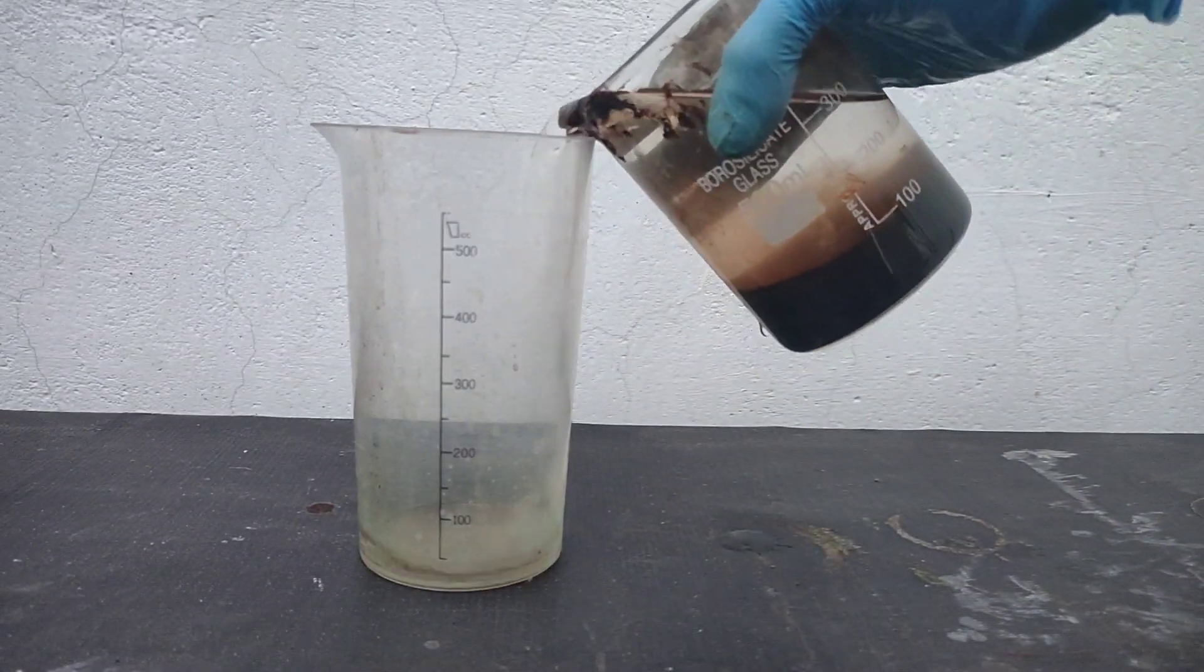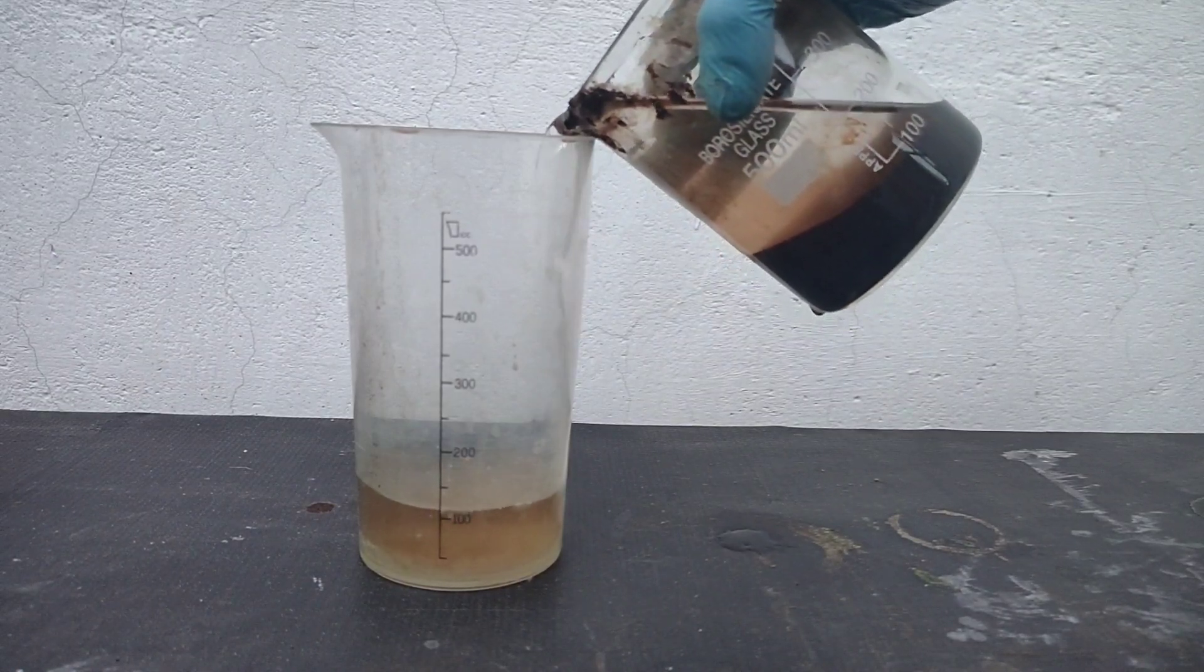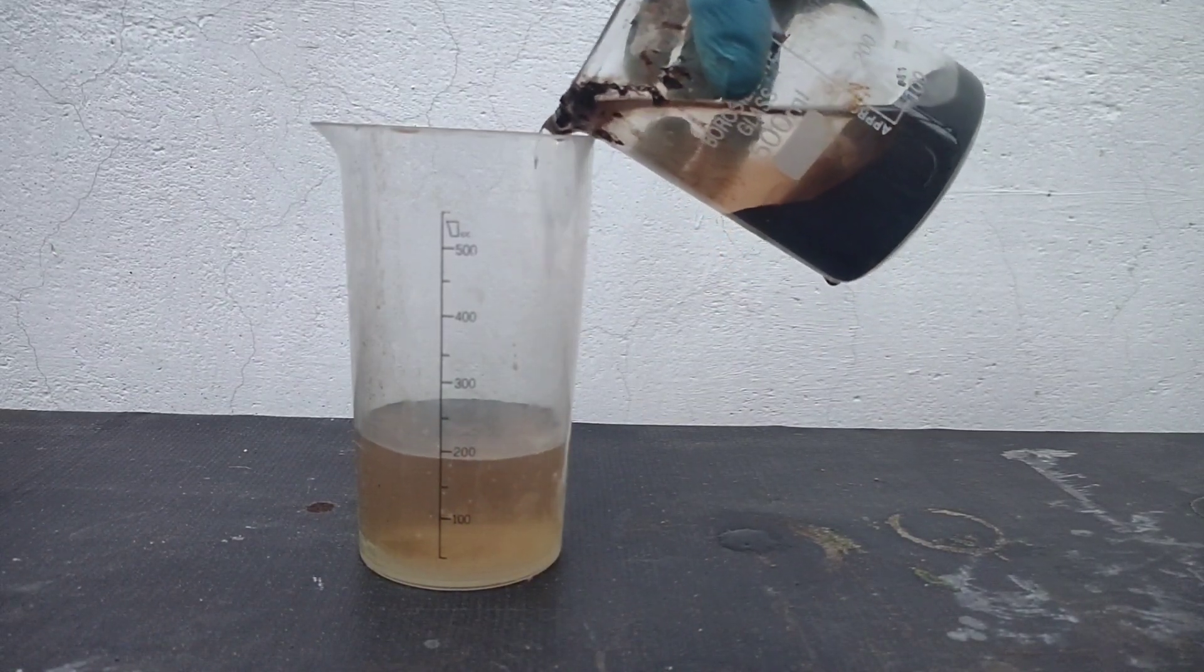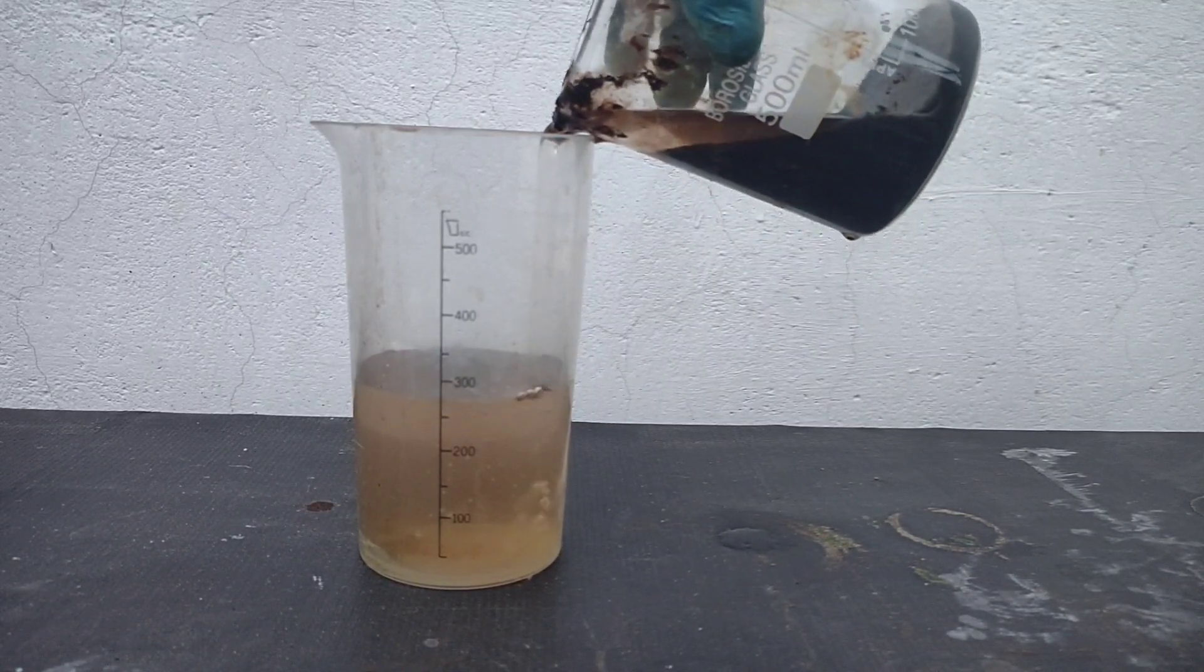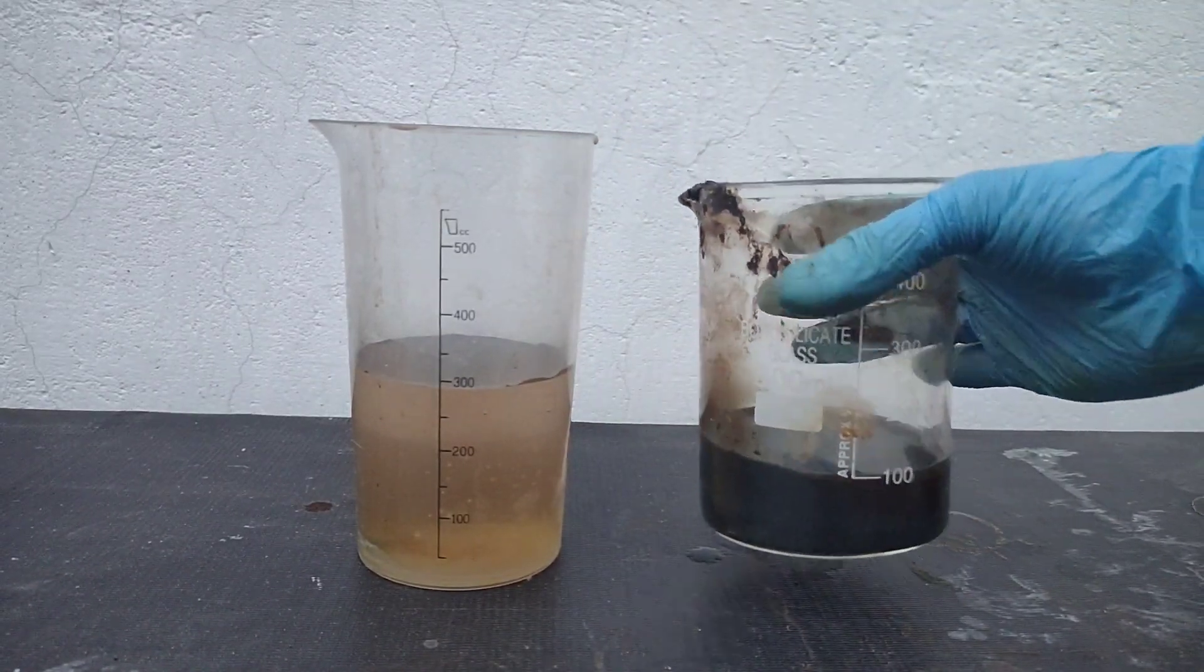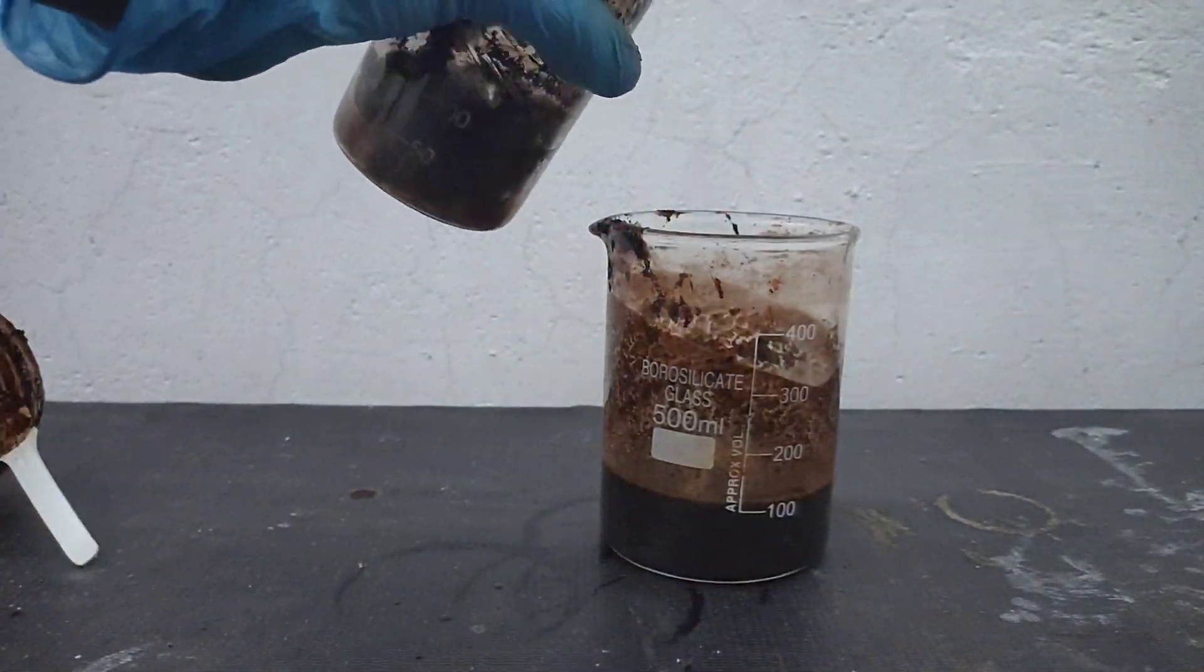With the leftover suspension I added water, let it sediment and decanted the supernatant liquid. I repeated this washing step 3 times to remove the soluble salts. Then I combined the washed slurry with the washed precipitates.